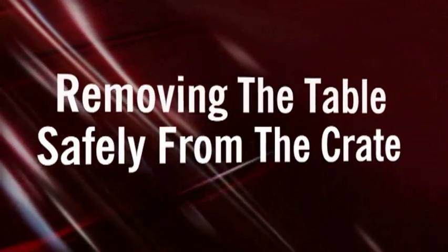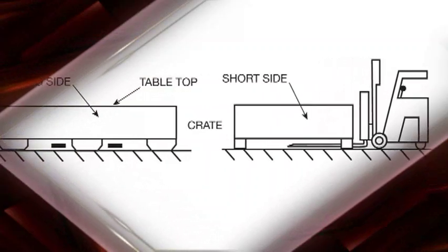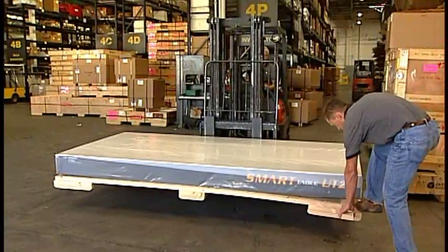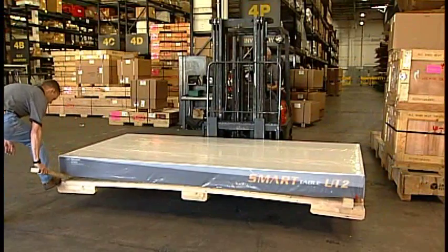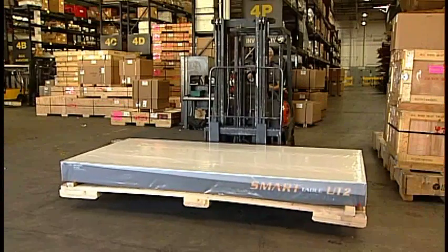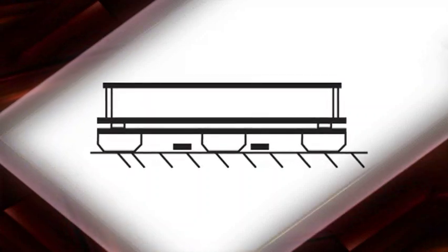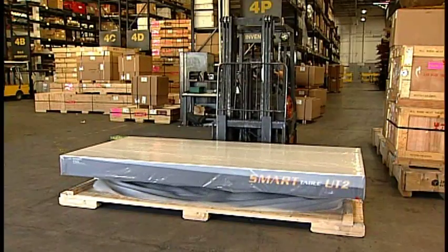To remove the table safely from the crate and lift it off the pallet, use a forklift to lift the table approximately 6 inches to 1 foot off the floor. Step on a corner of the pallet to create a space between the bottom of the table and the pallet. Insert a 4 inch by 4 inch piece of wood into this space. Repeat for the other end of the table, then lower the pallet to the floor, back the forklift out, and reposition the forks into the space between the pallet and the bottom of the table, centered under the table.